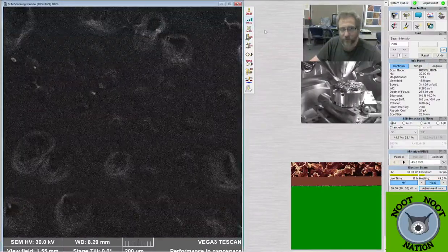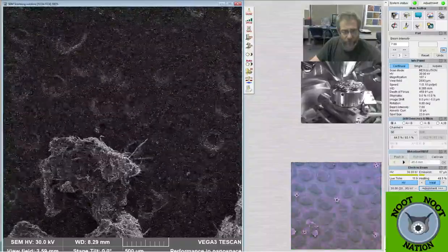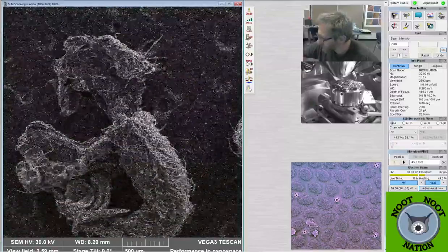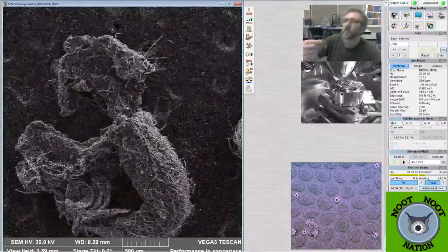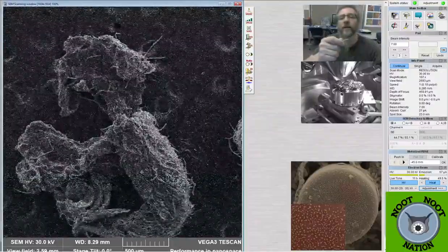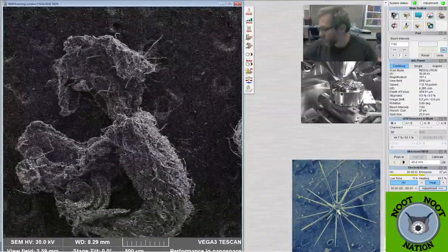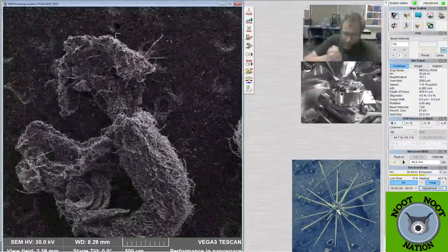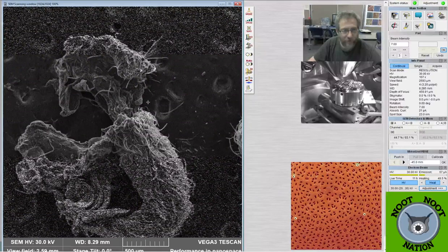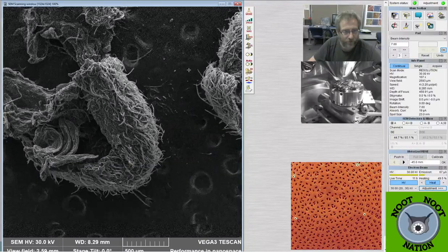So sample 6 actually has 2 different materials on it. I smushed what I think was locust, and also I think this is maybe oak, but I'm not positive. These are from trees, and rather than doing the flowering part, I grab these things, which I think have the pollen that it's producing in them, and then I just kind of smash them onto the tape and smash them a bit. So I wasn't totally sure if it's what I wanted to be looking at for tree pollen, but that's what these things are.